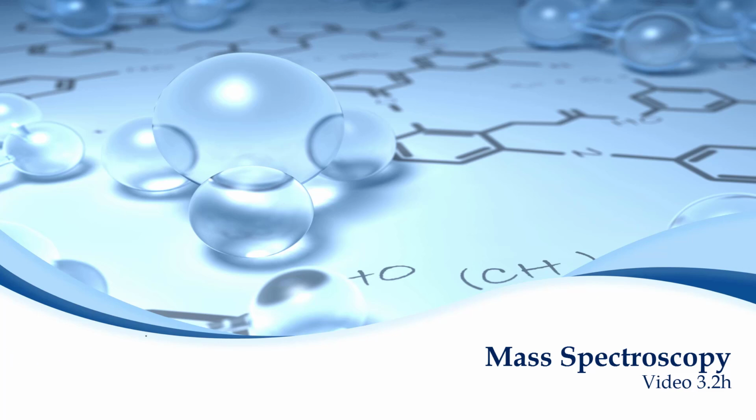In this video, we're going to talk about mass spectroscopy, which is the tool that we use to help figure out the data that we used in our average atomic mass examples. This video is going to be done in a couple of parts. We're going to have the normal PowerPoint portion of the video. I'm also going to have a little bit of a demonstration where I'm going to use a tool that one of my professors made, a demonstration of how mass spectroscopy actually works.